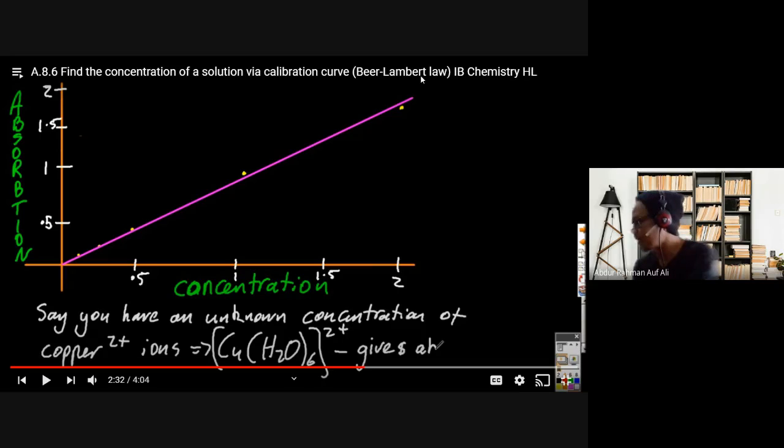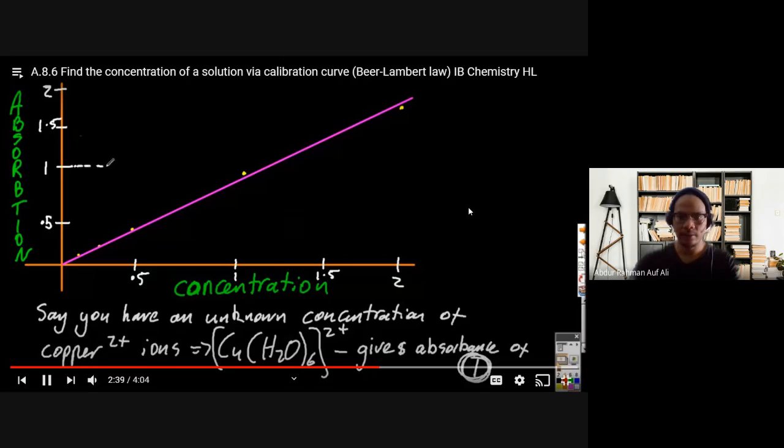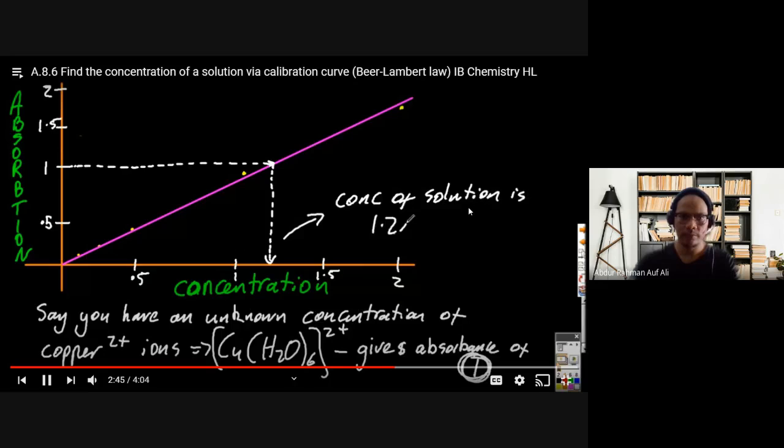Sorry guys, berat ni kenapa? Okay, put it in. Okay, done. Jangan angkat. No, heavy. Satu yang kena pakai saja. Sorry guys. Okay, so dekat sini dia ada tunjuk. Saya nak fast forward tadi.